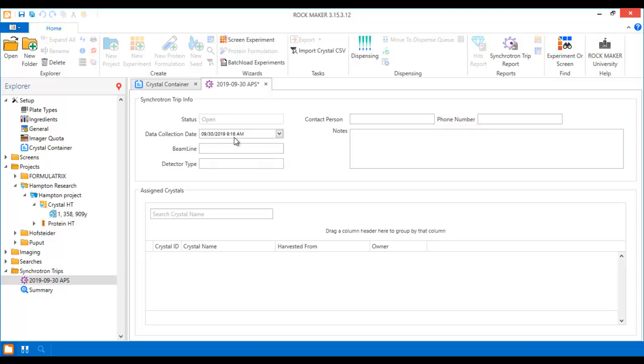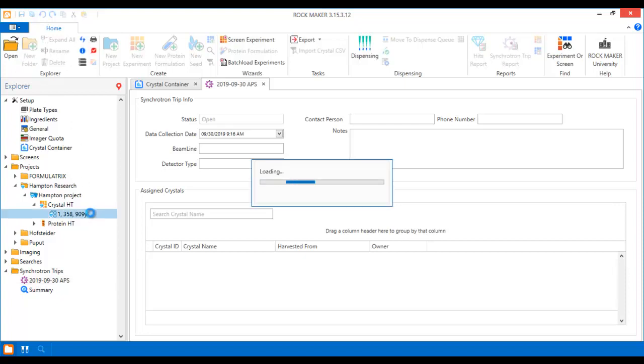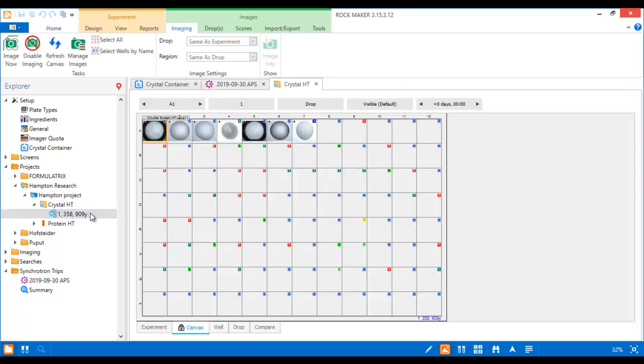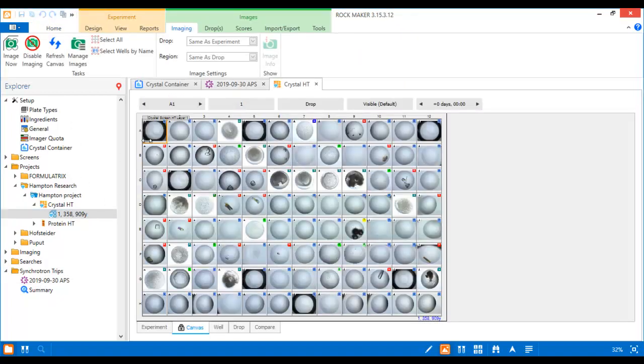Now it's time to virtually harvest your crystals in RockMaker. This is the part where you mark crystals in RockMaker that you will harvest later in your lab. Open the desired experiment and scroll through the drops to find the ones that contain crystals.